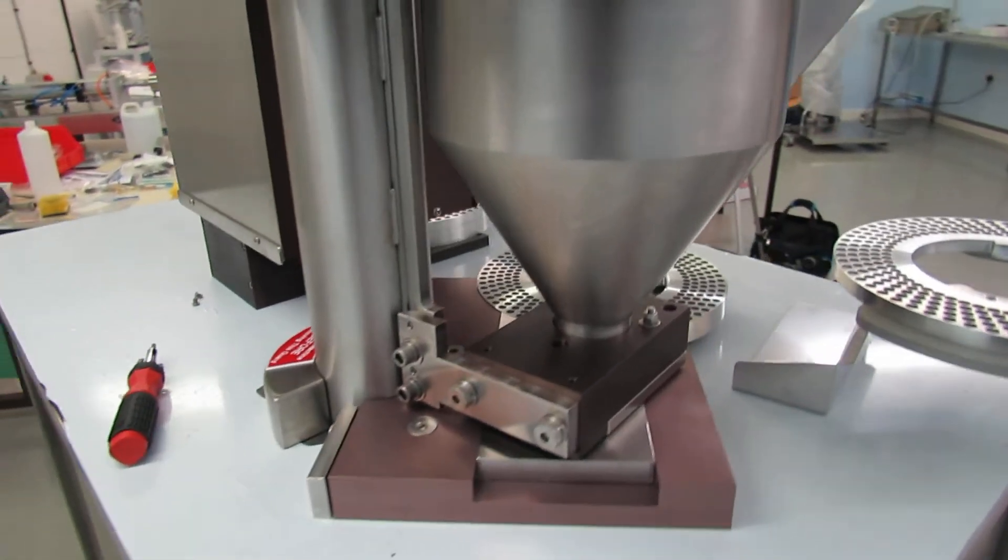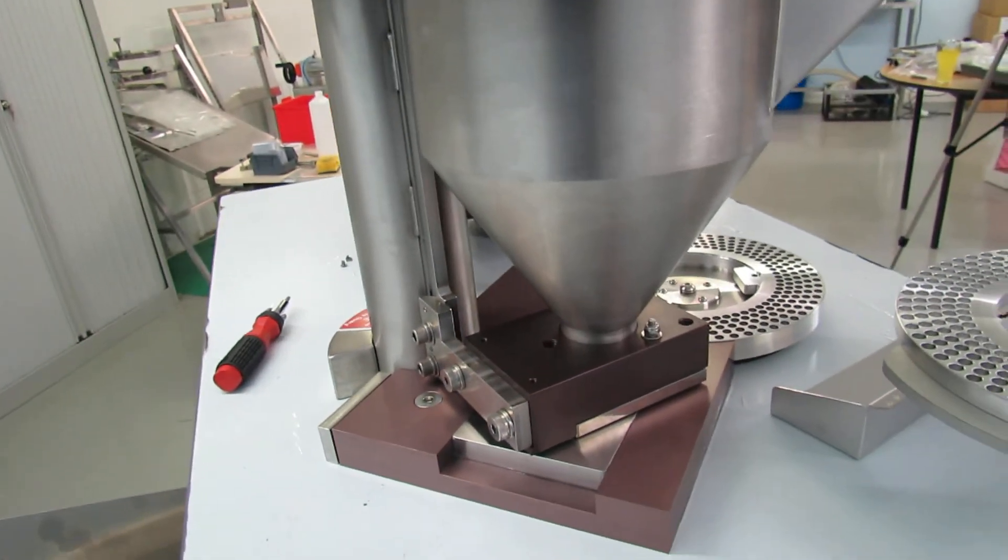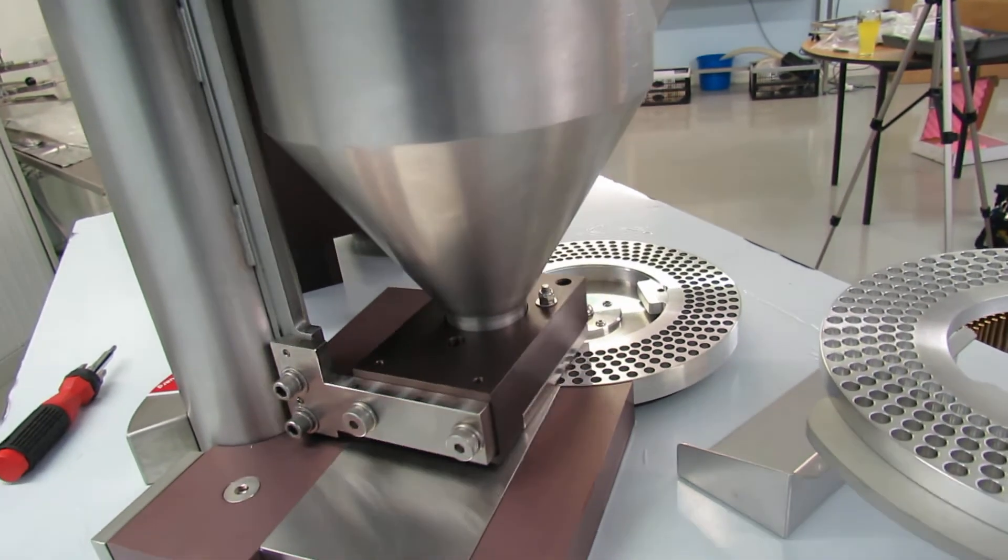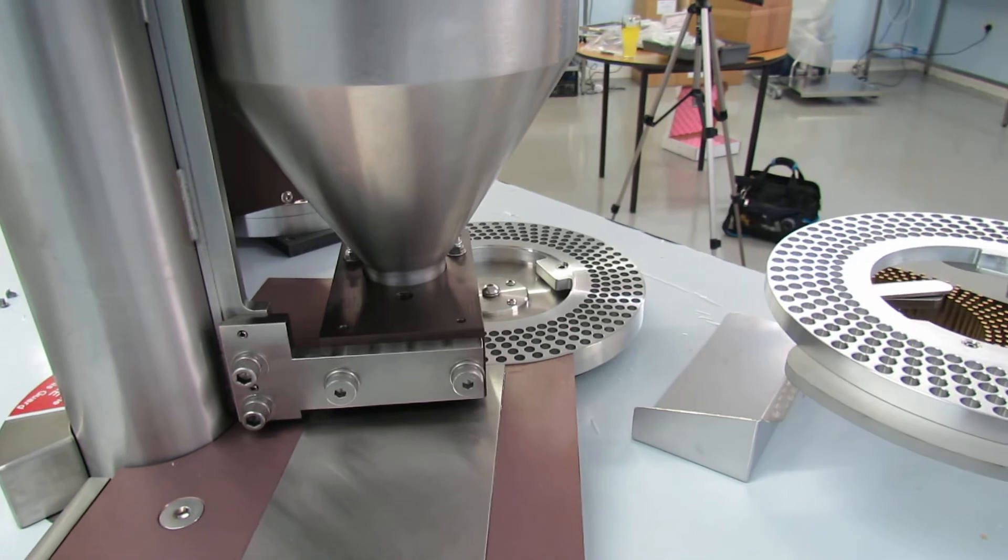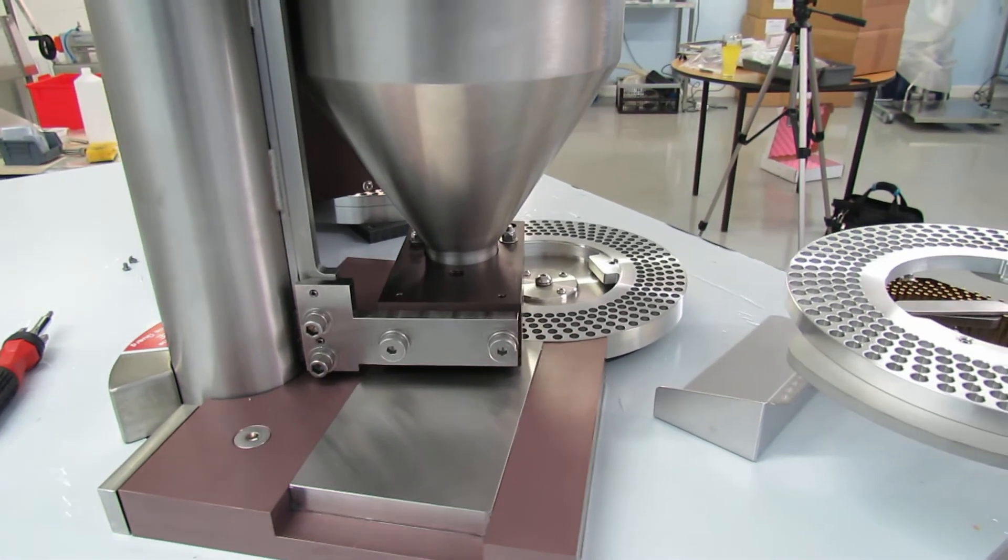We are going around to the powder filling station, which obviously swings across under its own power, which I will do in the second video.